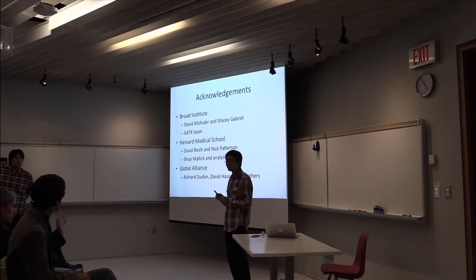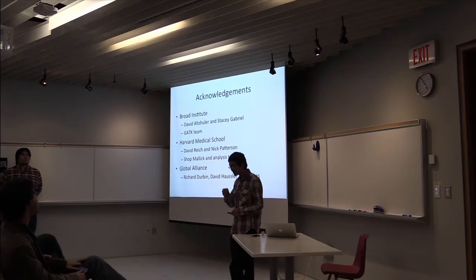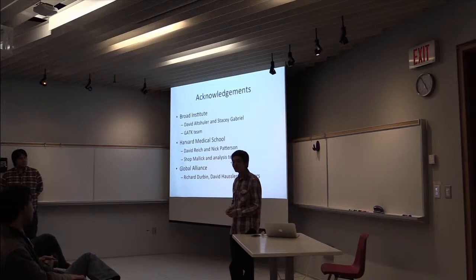So you think that this PacBio assembly that they did, just based on their own data, is better than the current version of the human genome? I think currently it's not as good. PacBio hasn't released their assembly yet. The group doing the assembly is trying to publish a paper.